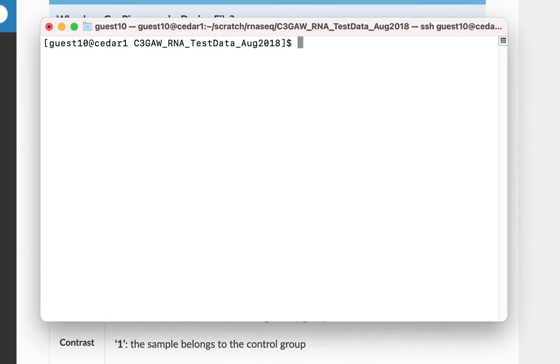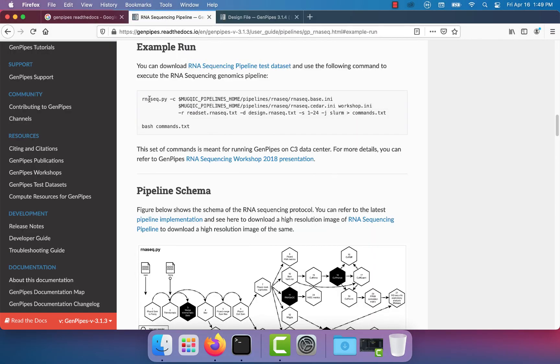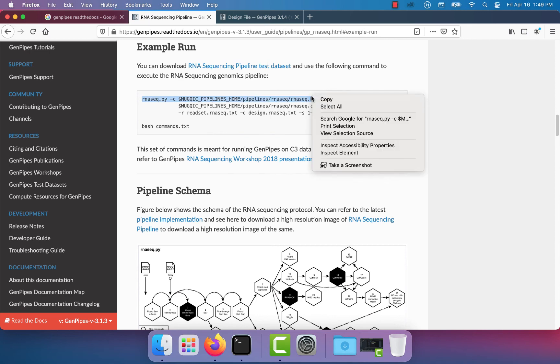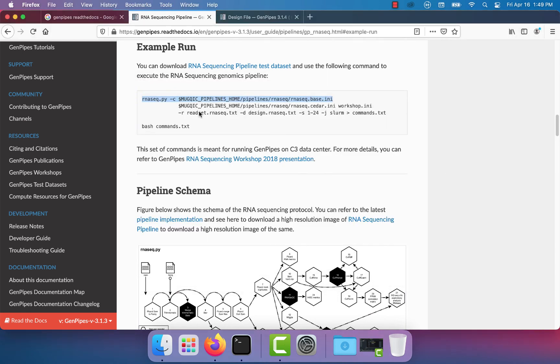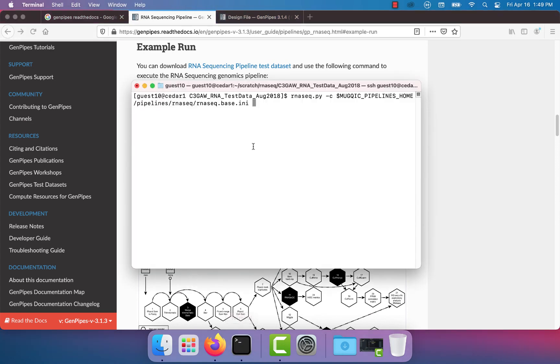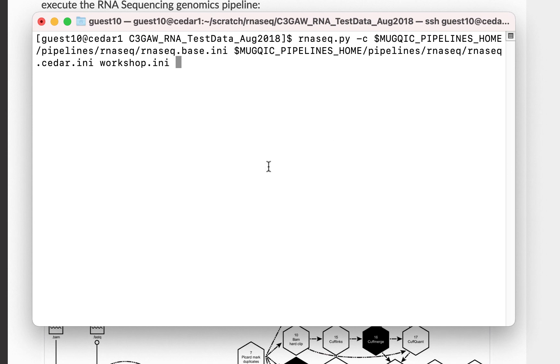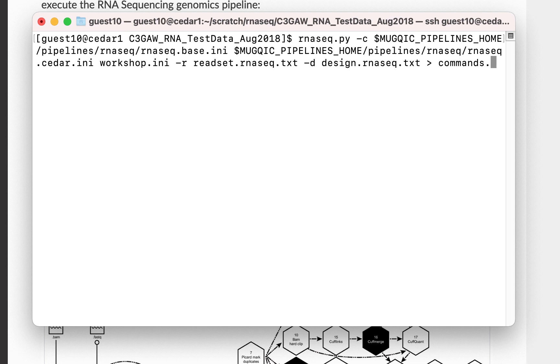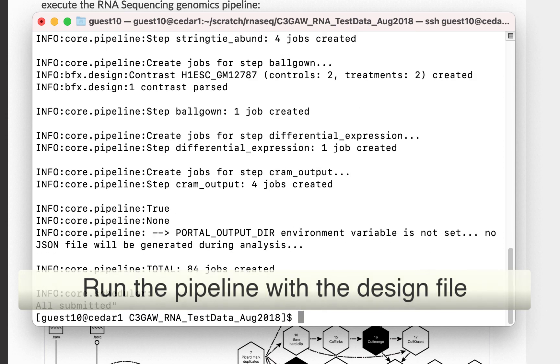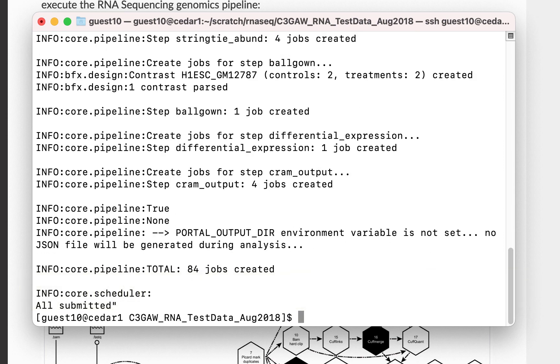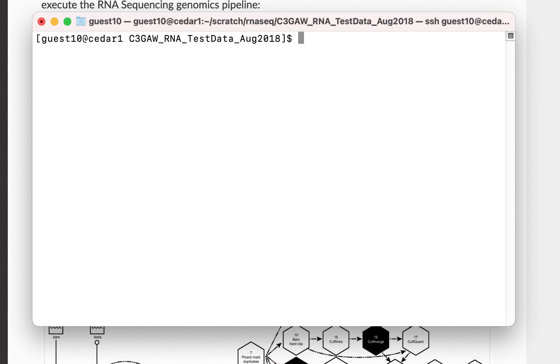Let's run the pipeline by specifying the design file. Copy the lines of code in the documentation, paste them in the command line and modify them accordingly. Finally, you can submit the jobs you created. Once the jobs are completed, you will get the results.